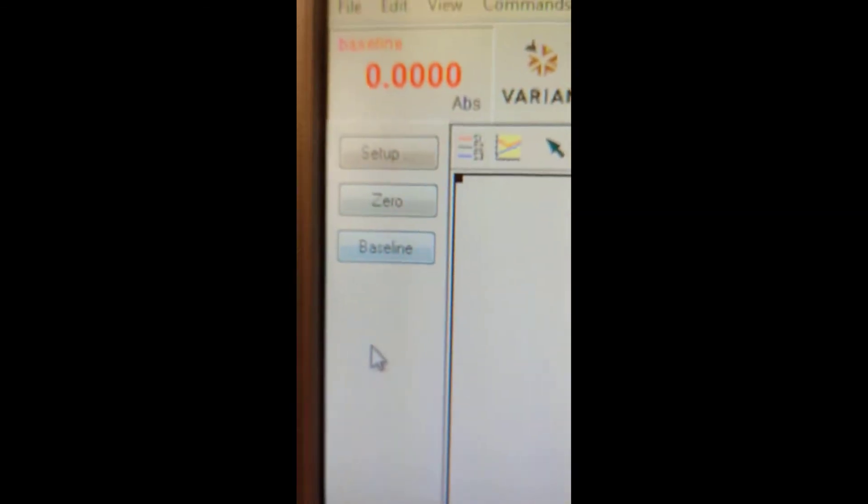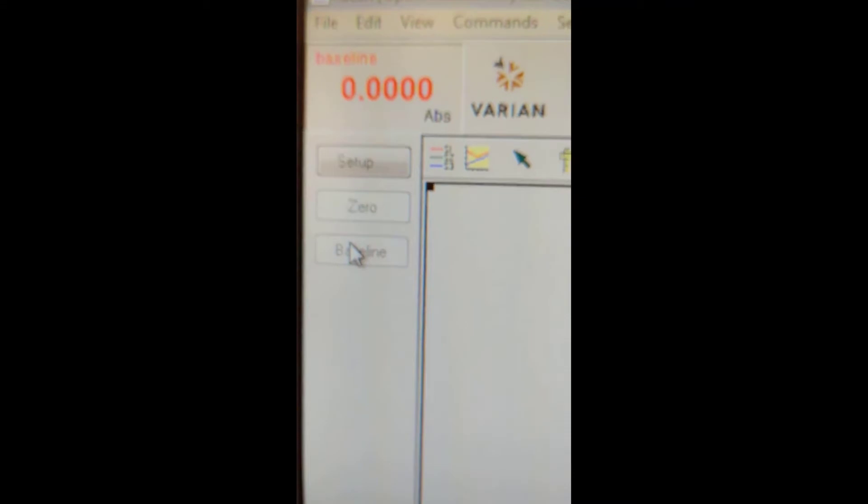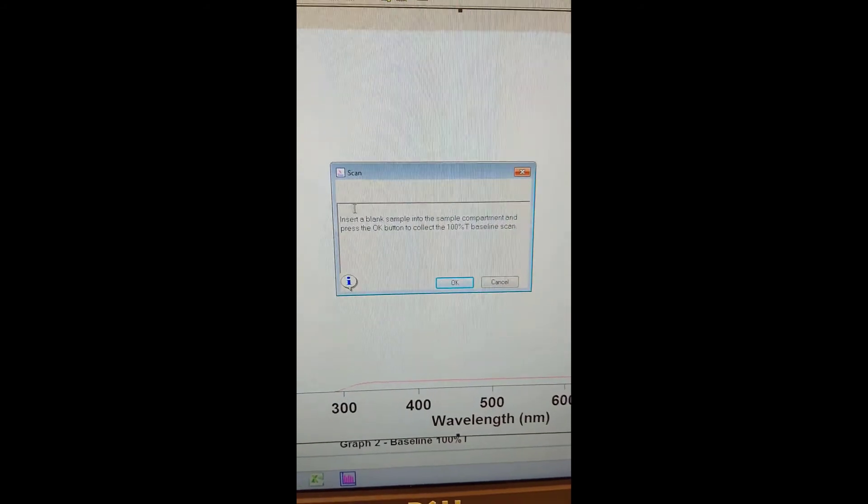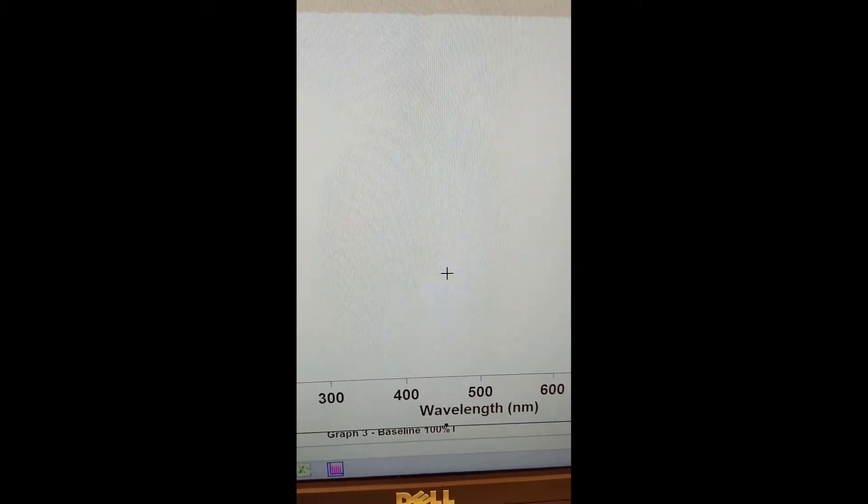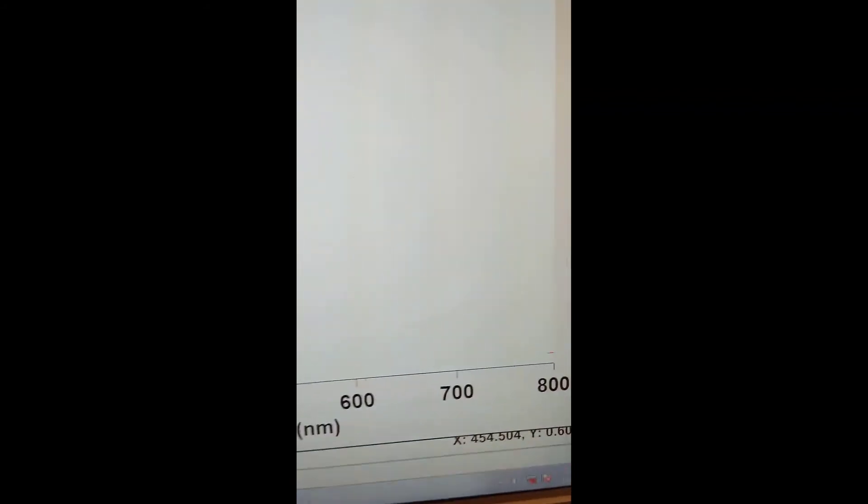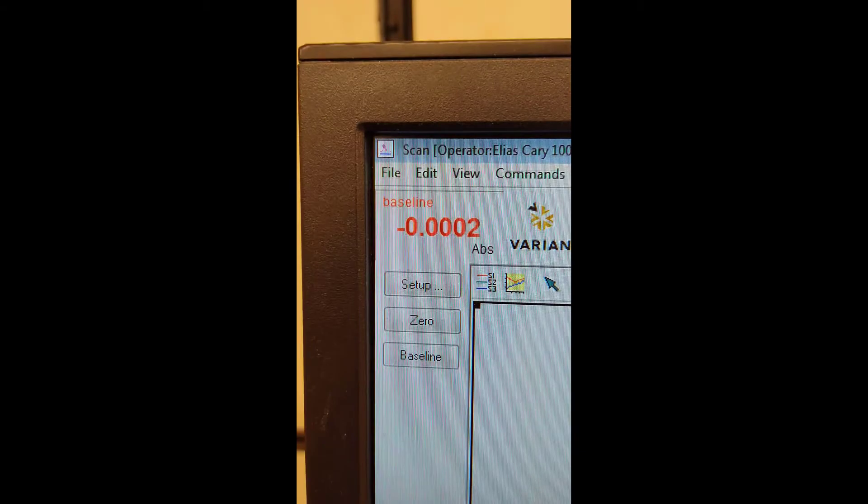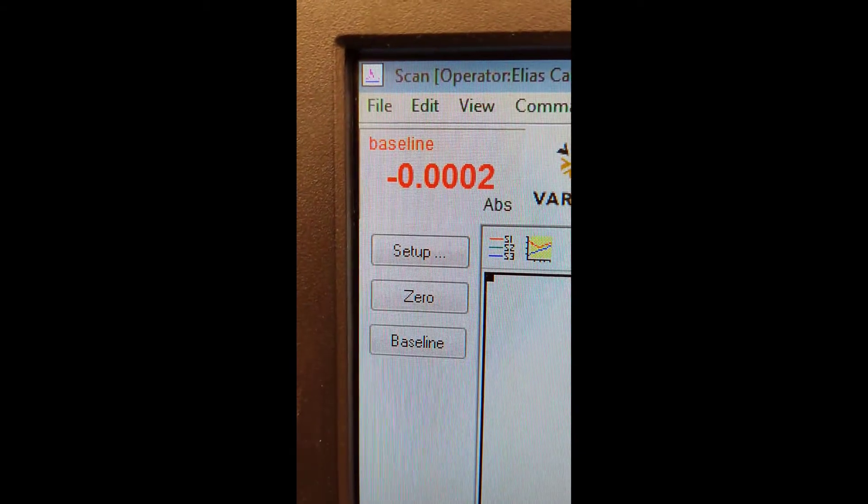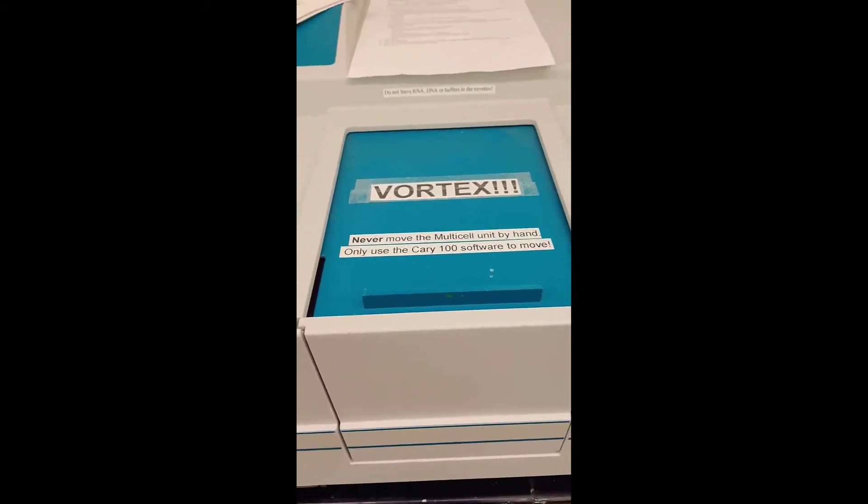Once the instrument is zeroed, I can collect the baseline. Just click baseline. It's going to prompt us to put our blanks into both sample compartments. Just hit OK, and then it should start to collect the baseline. Once the baseline is collected, you should see the word baseline in the top left corner.